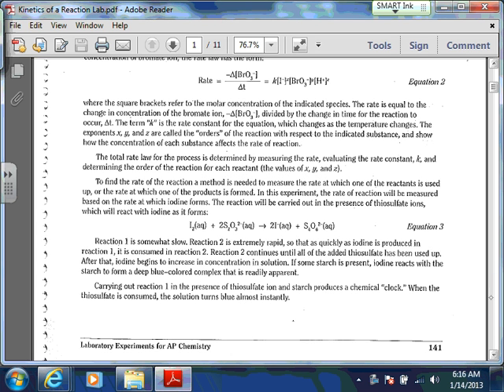There's a lot of background information in this lab. And it's showing you the rate law for this thing. Now, the thing is, we don't know exactly what the rate law is because we have to figure that out experimentally. We don't know what the exponents are. Okay, so we've got our I minus concentration, our BrO3 minus concentration, our H plus concentration, and we want to figure out how changing the concentration of those things affects the rate so that we can write our rate law.